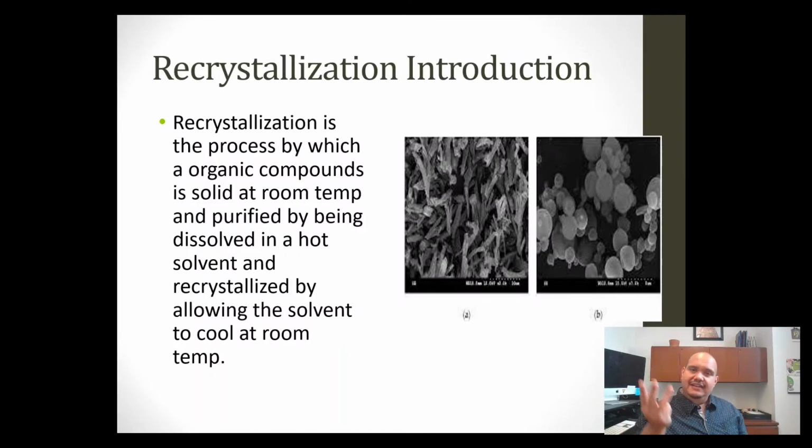And the third is precipitation, which can actually happen in this course if you take a solution and you oversaturate it. Rather than getting crystals at the bottom, what you'll get is a very fine precipitate. If you diverge from the procedure and do what's referred to as an ice shock, which we'll talk about a little bit more, you will actually force the crystals to precipitate down.